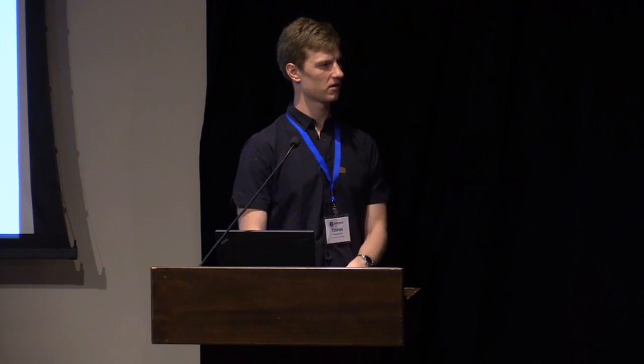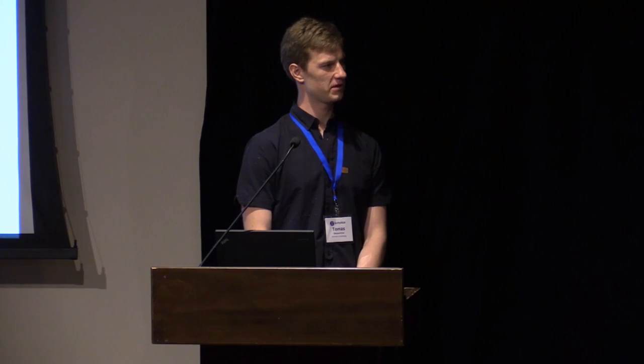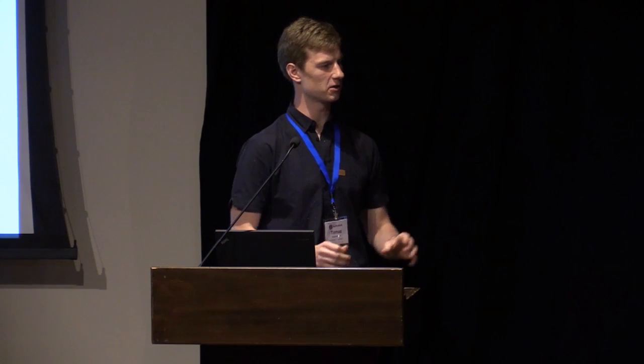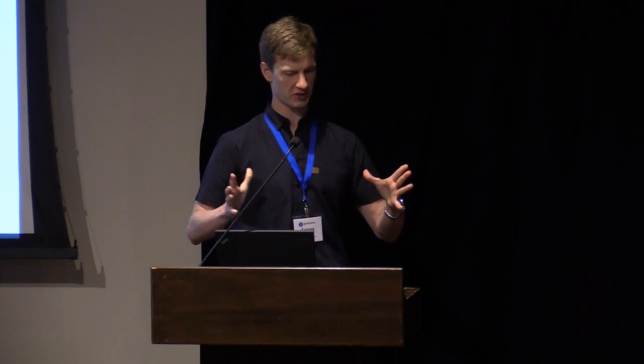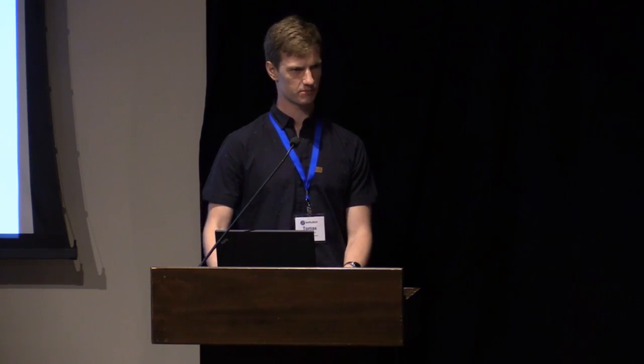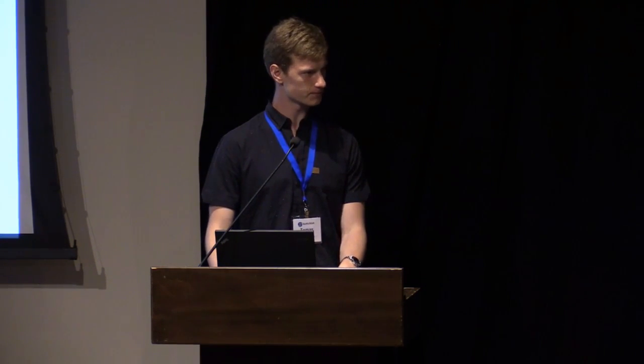Yes. Yeah, I think xarray is better for wrangling the whole thing into a single object, the package xarray. I believe it does that well. I think it's worth actually looking at how to combine the two ideas. Since I think HyperSpy's biggest asset is the idea of navigation and signal spaces, because it allows you to perform a lot of operations over n-dimensional data sets, and it just becomes intuitive to think about. OK, thank you very much.